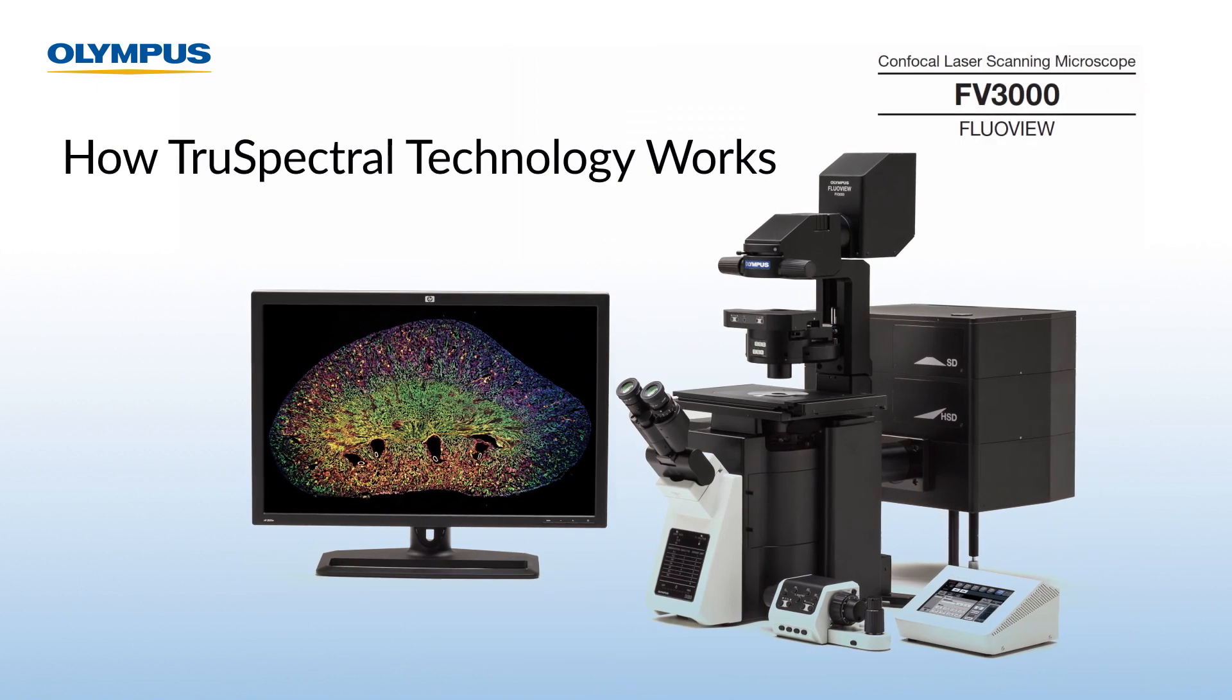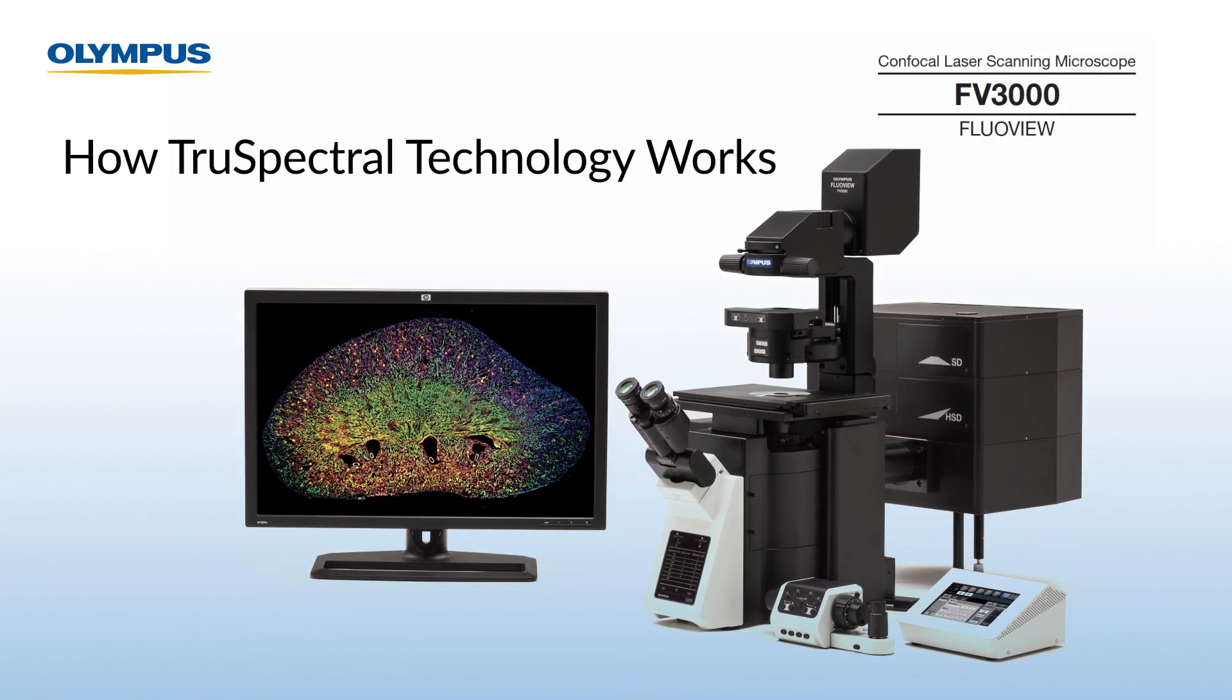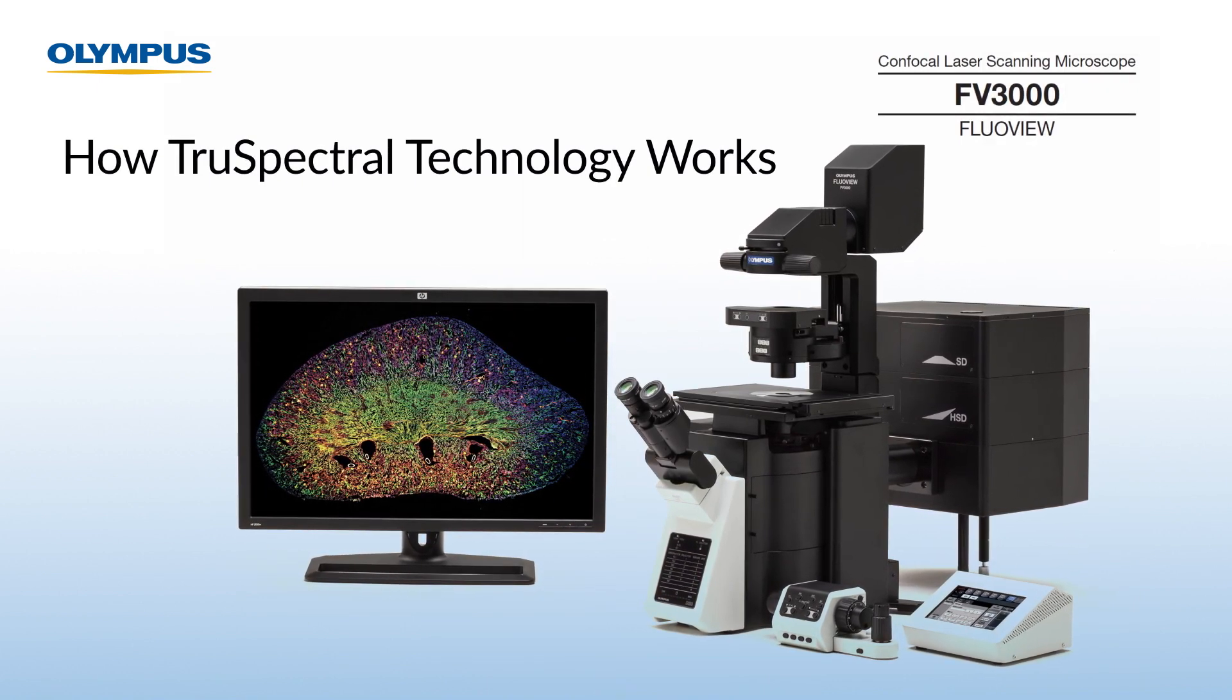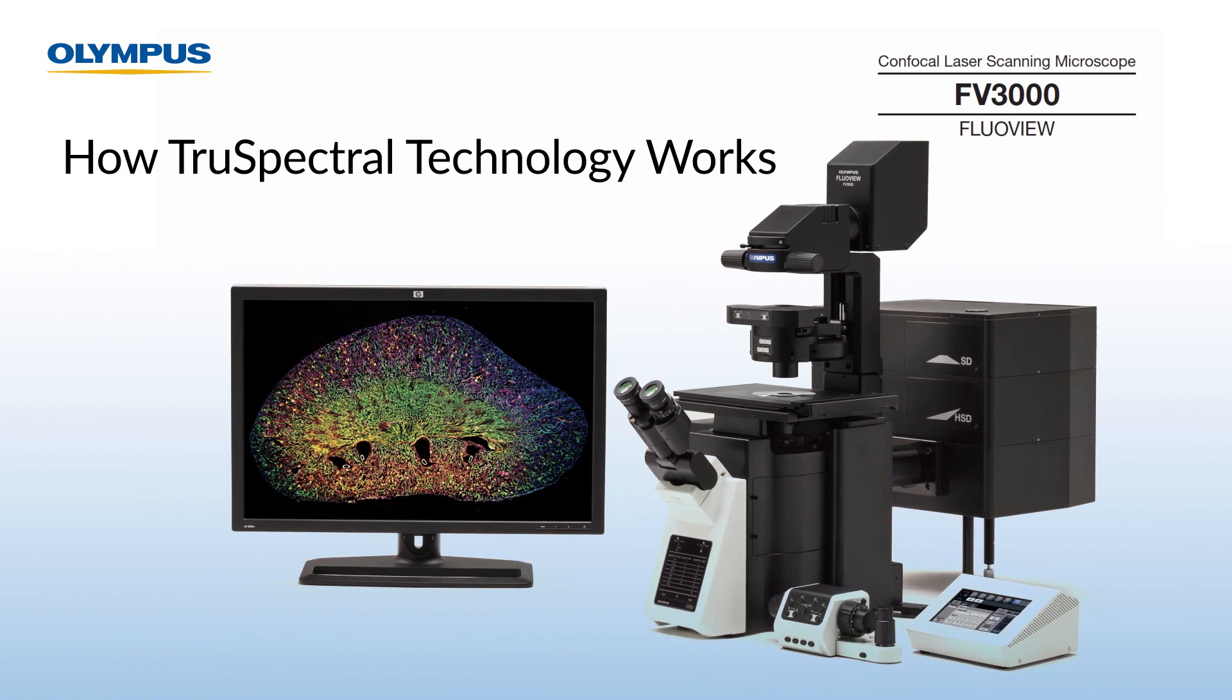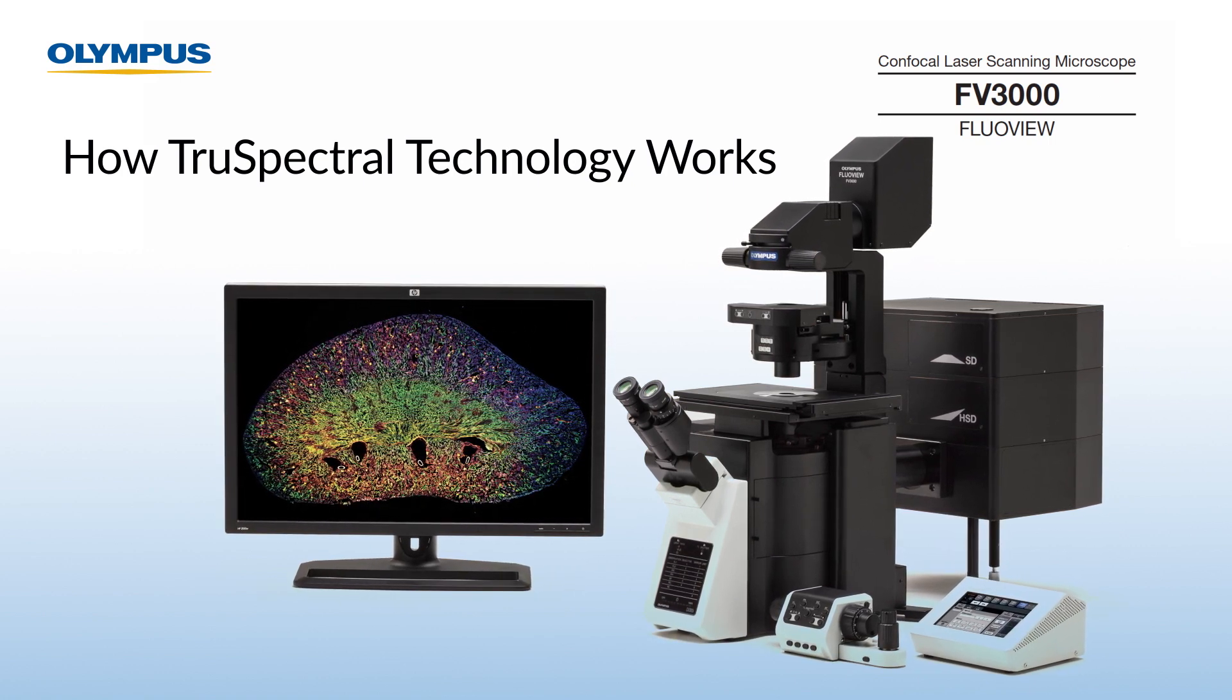Olympus' patented TrueSpectral technology improves spectral detection efficiency. See how TrueSpectral works in the FV3000 LightPath to improve your research.